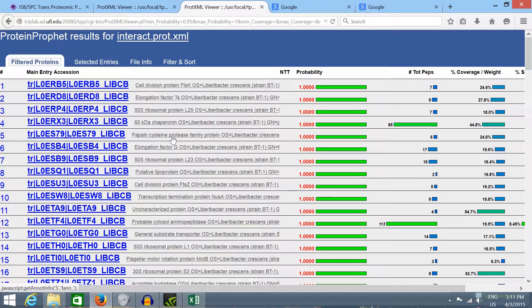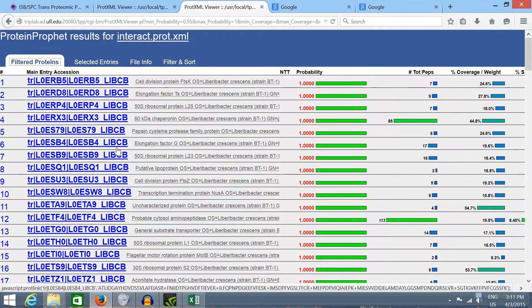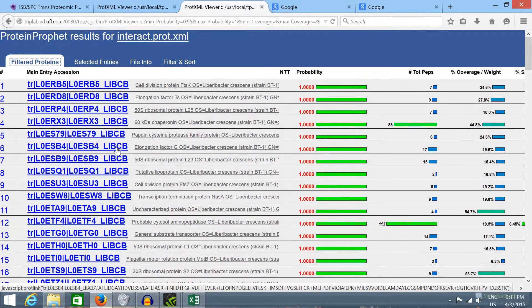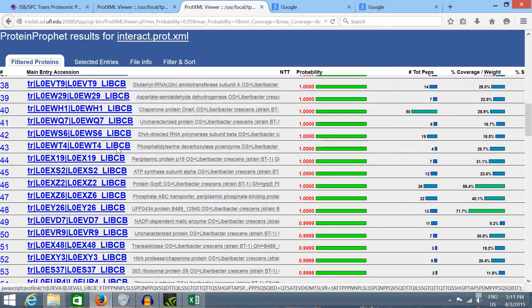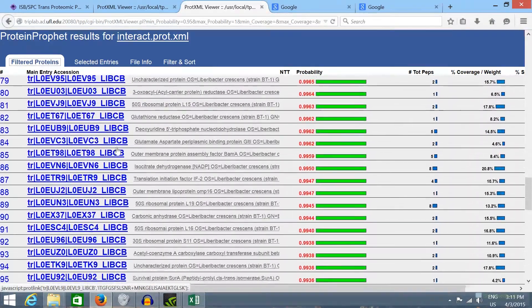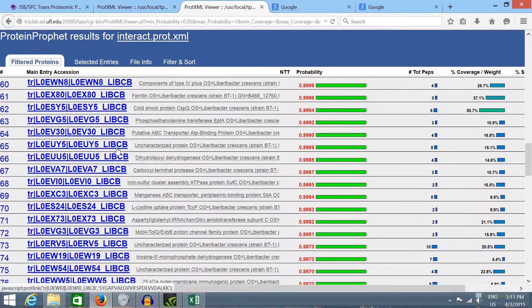If you followed all the steps of the previous tutorial you should be able to view this result table from the TPP.